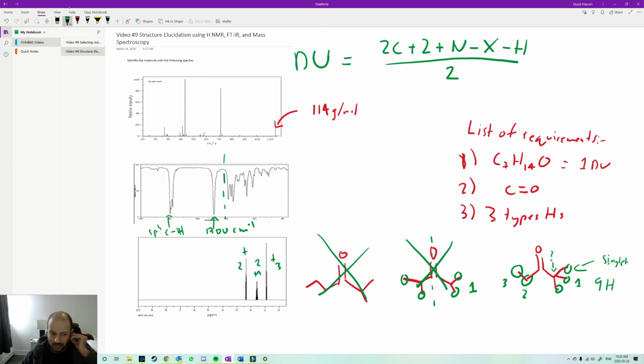Now, that's not necessary. If this was 9 hydrogens, right? This could still be 6 hydrogens and 6 hydrogens. That's a possibility, and that would give me an integration of 3:2:2 because 9:6:6, that ratio ultimately is 3:2:2, so that could still work.